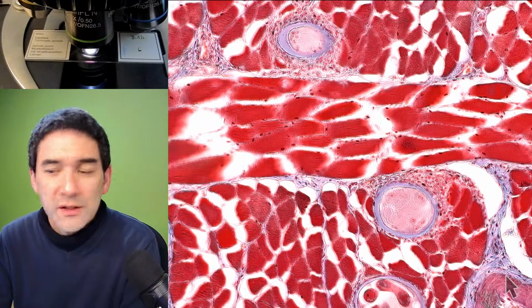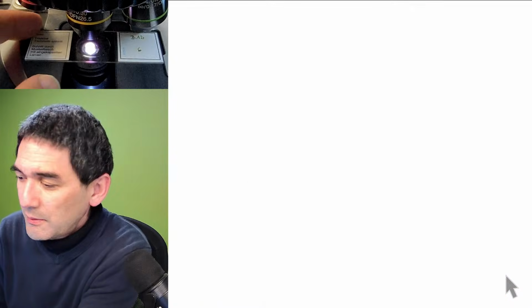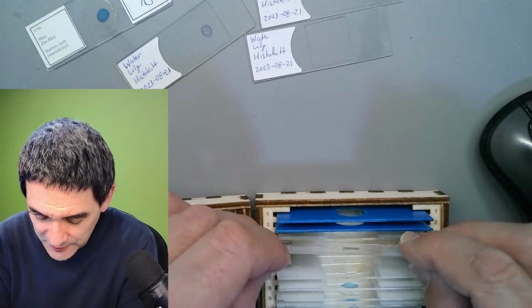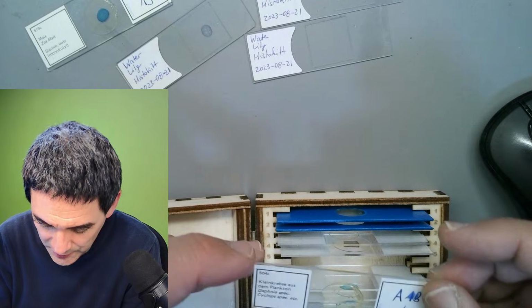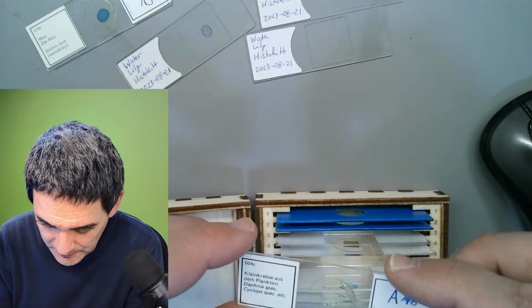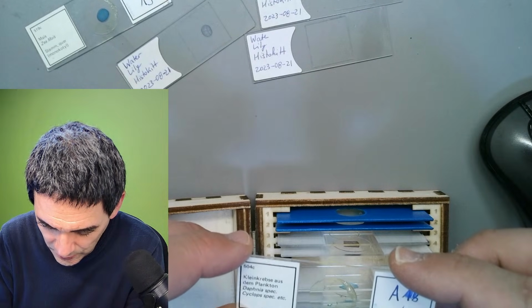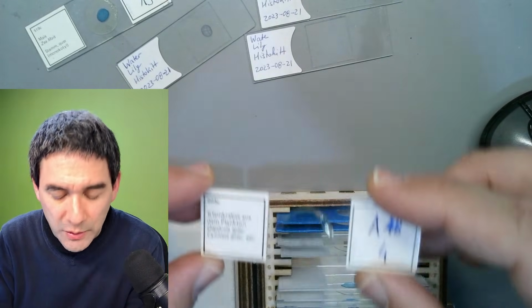So let's move on a little bit. Gee, this takes me longer than I anticipated, but it's fine. I do still have a couple more. This is a nice one over here. What is this? Oh, I took out the wrong slide here. That's not one that I actually want.